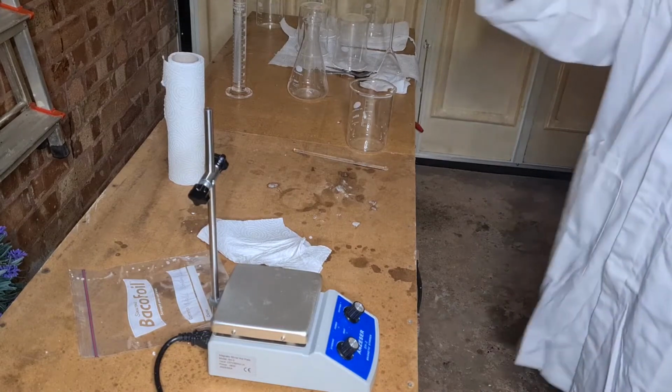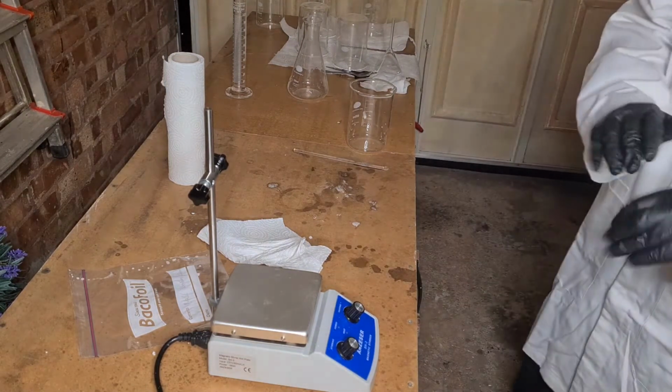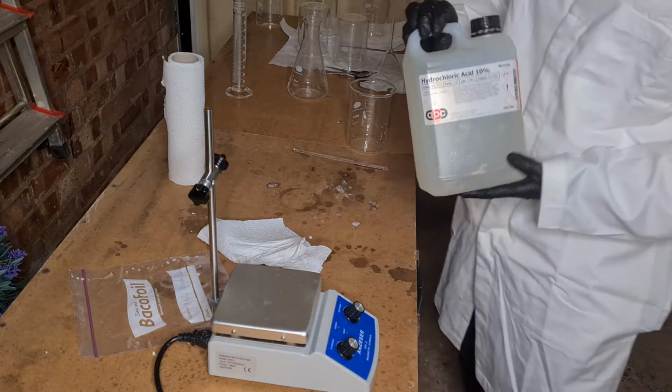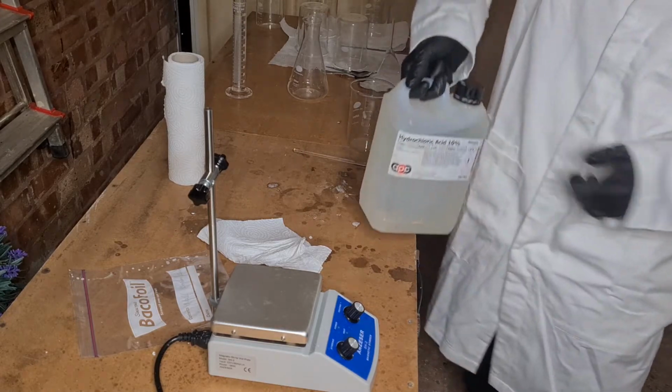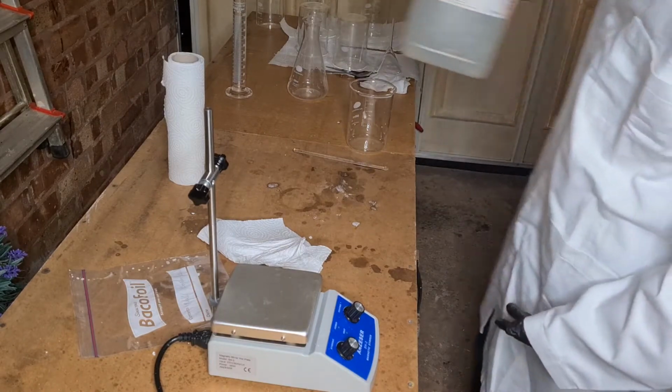And 3 that are required are these gloves, this lab coat, and these goggles, because this stuff right here, not very nice to get on your hands. Hydrochloric acid. It's corrosive, it has the warning label right there. So you might be wondering, why am I handling it? Because I have really irresponsible parents.